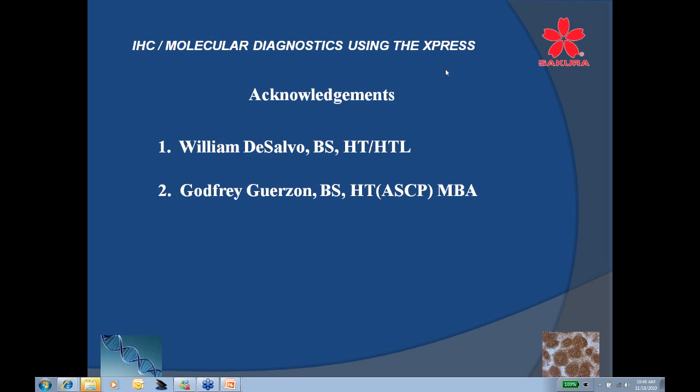Okay, resection borders, that was more or less the question. Although I have done some validation with breast on the Xpress, I certainly have not completed this because we're doing some studies here. So we still leave our breast presently on the VIP. But I would think that, number one, I'd refer to CAP guidelines if they don't have any answers for that. I've written the question down, and I'm going to explore that myself. I would encourage maybe that participant, if they would also send me an email, I'll know who to respond to.